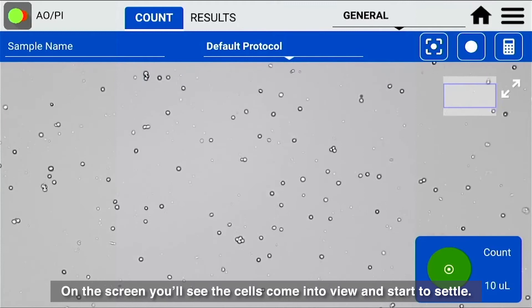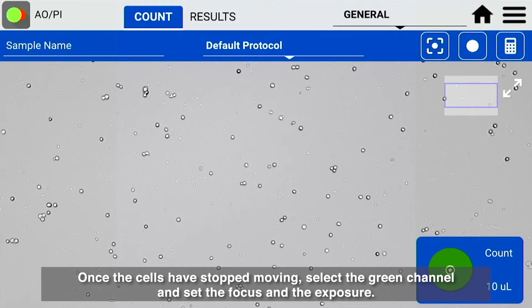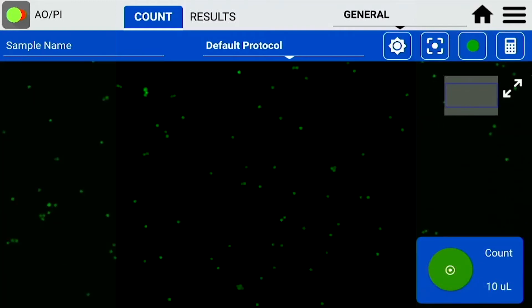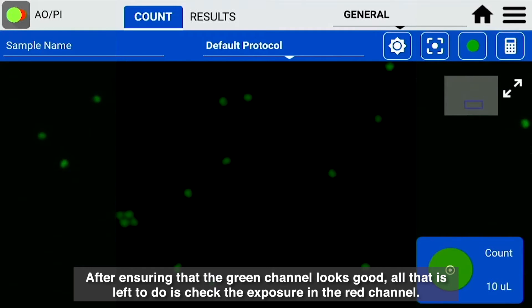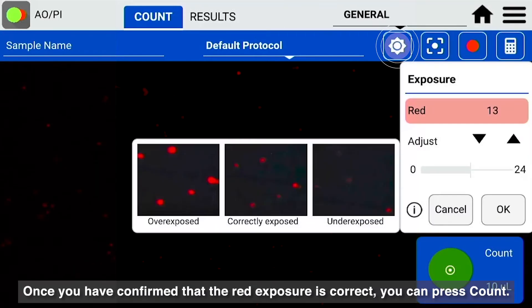On the screen, you'll see the cells come into view and start to settle. Once the cells have stopped moving, select the green channel and set the focus and the exposure. After ensuring that the green channel looks good, all that is left to do is check the exposure in the red channel. Once you have confirmed that the red exposure is correct, you can press count.